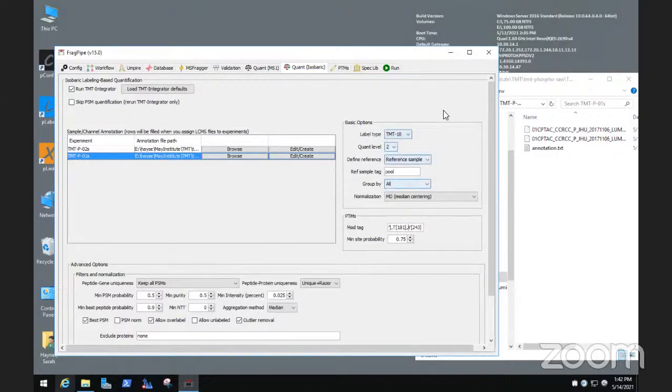Yeah, so this part we're actively working on streamlining a little bit. So in the next release, it may be easier to specify modifications to TMT Integrator for the reports. Now you need to know what the mass shift is, and what the total mass is, which is not very intuitive. Like you need to know that it's STY where it's the T181, right?